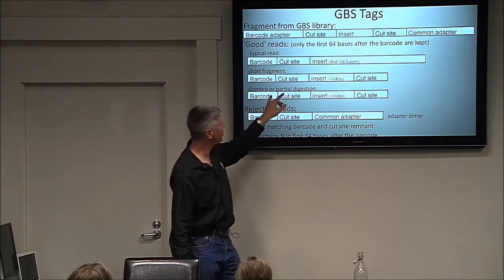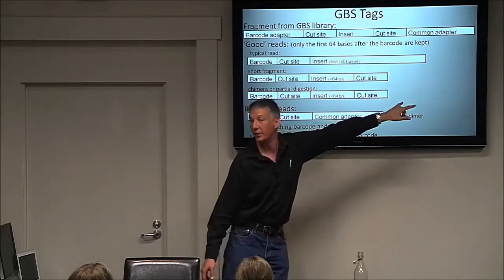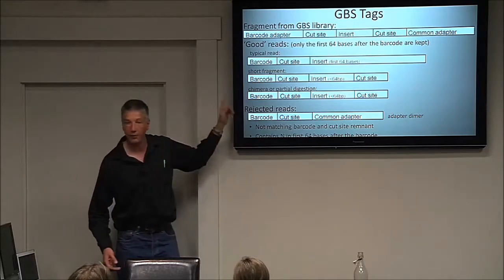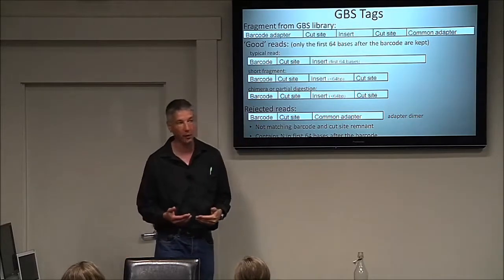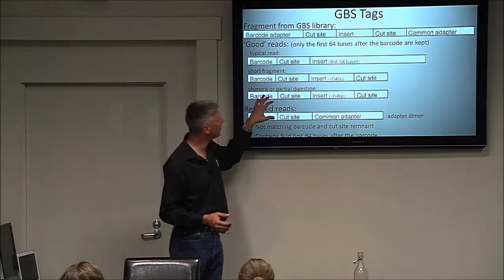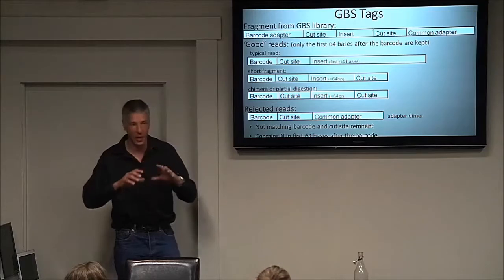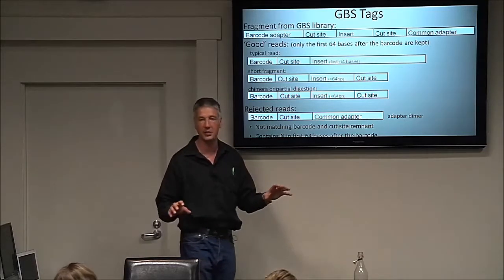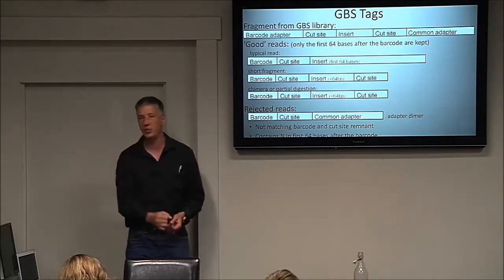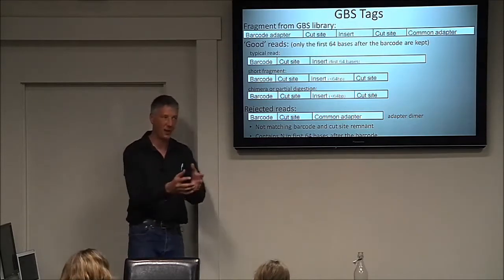When we're talking about a partial digestion or a chimera, you'd see the barcode, the cut site, and in a shorter insert, a cut site, another bit of insert. And this is a really, really important point that affects not just the bioinformatics, but it's generated from the molecular biology. That's why I want you guys to get a feel for both of these bits. When you do a digest, you're cutting the DNA up, right? If you remember from this morning, we cut the DNA up with a restriction enzyme. It has these sticky ends. It's in this well that has the adapters in them, right? And then we put some ligase in there. And the ligase just joins things back up, right? It's pretty simple. You cut it up and you put it back together again.